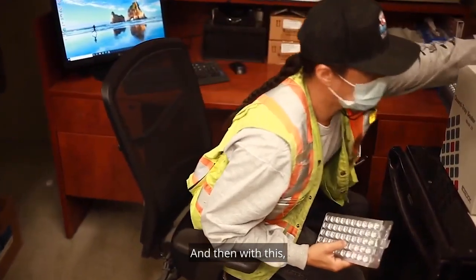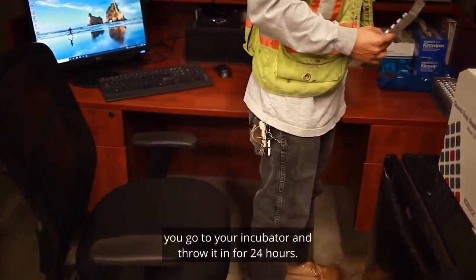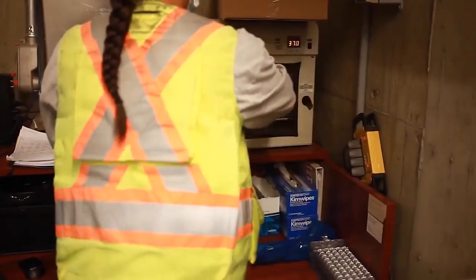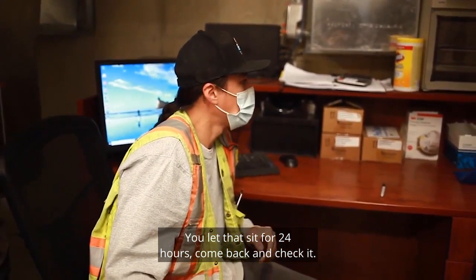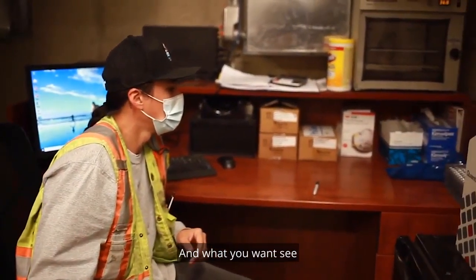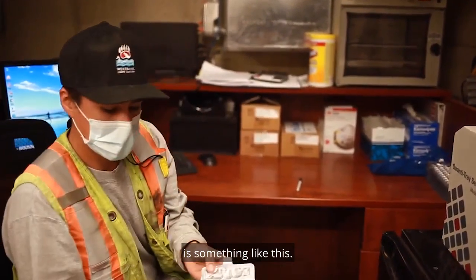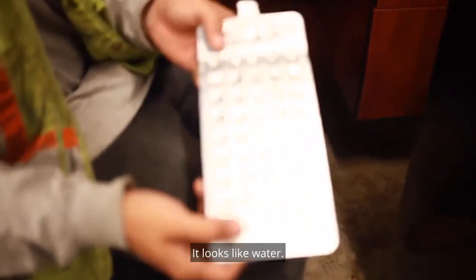Then you go to your incubator and put it in for 24 hours. After 24 hours, come back and check it. What you want to see is something like this — they're all clear, it looks like water. That means no contamination.